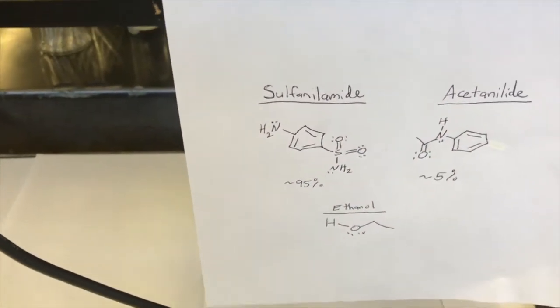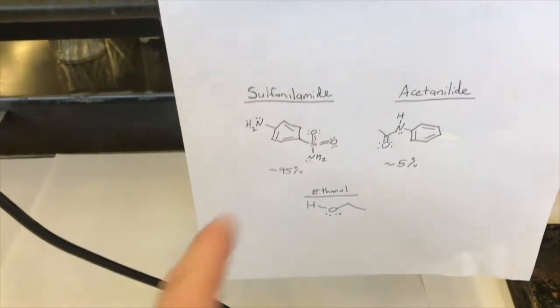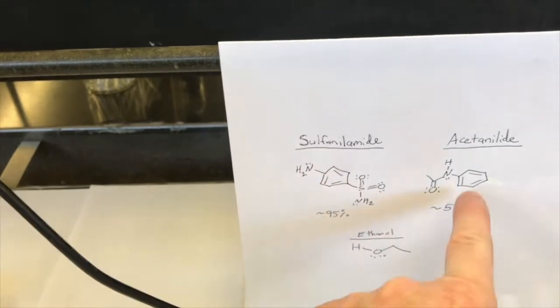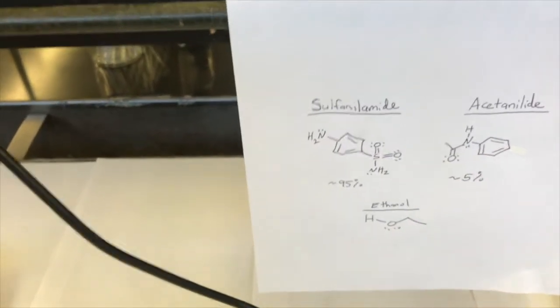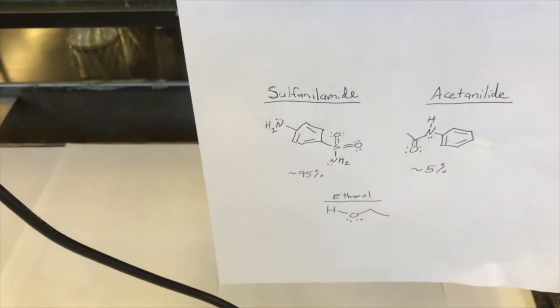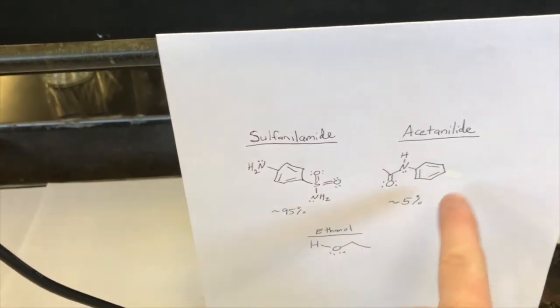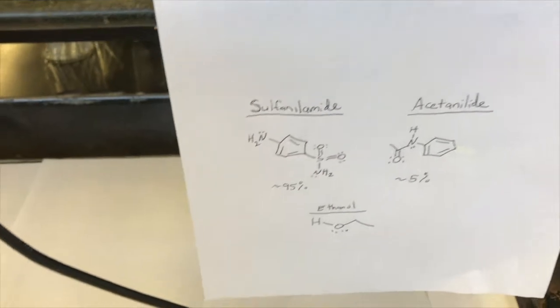an impurity. And it's actually a good choice for impurity for this because you can make the acetanilide into the sulfanilamide. You can do a synthesis, multi-step synthesis. I've done it in previous years with my students. And so there is a possibility that when you get your final target molecule, you have some of the original impurity in there and you want to purify it.